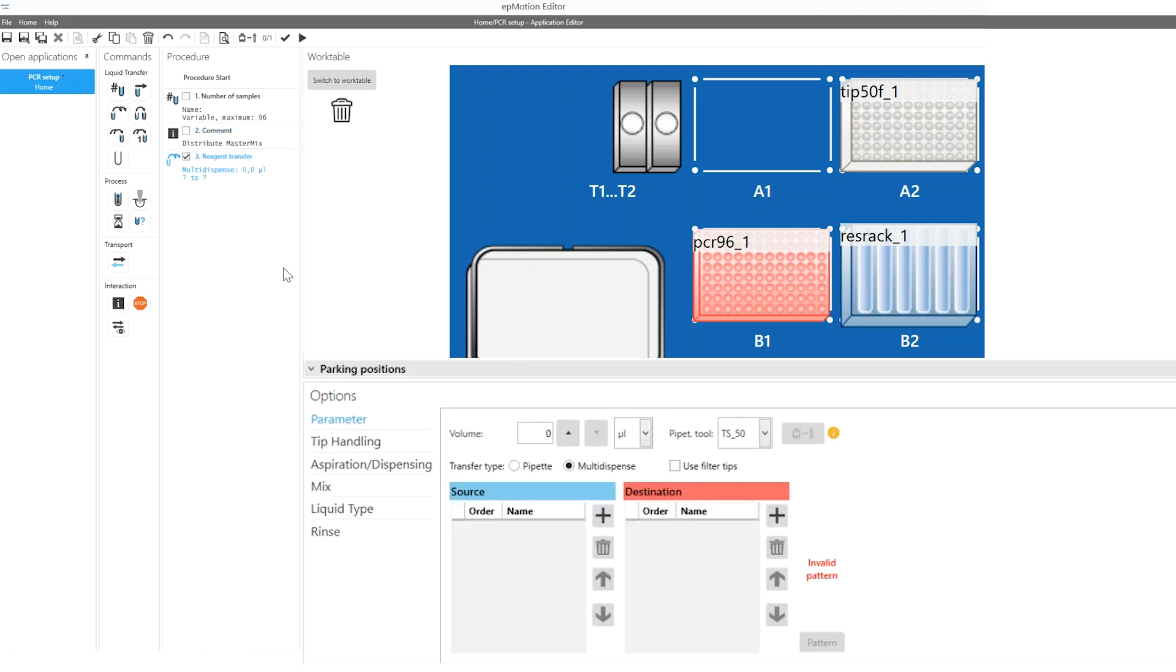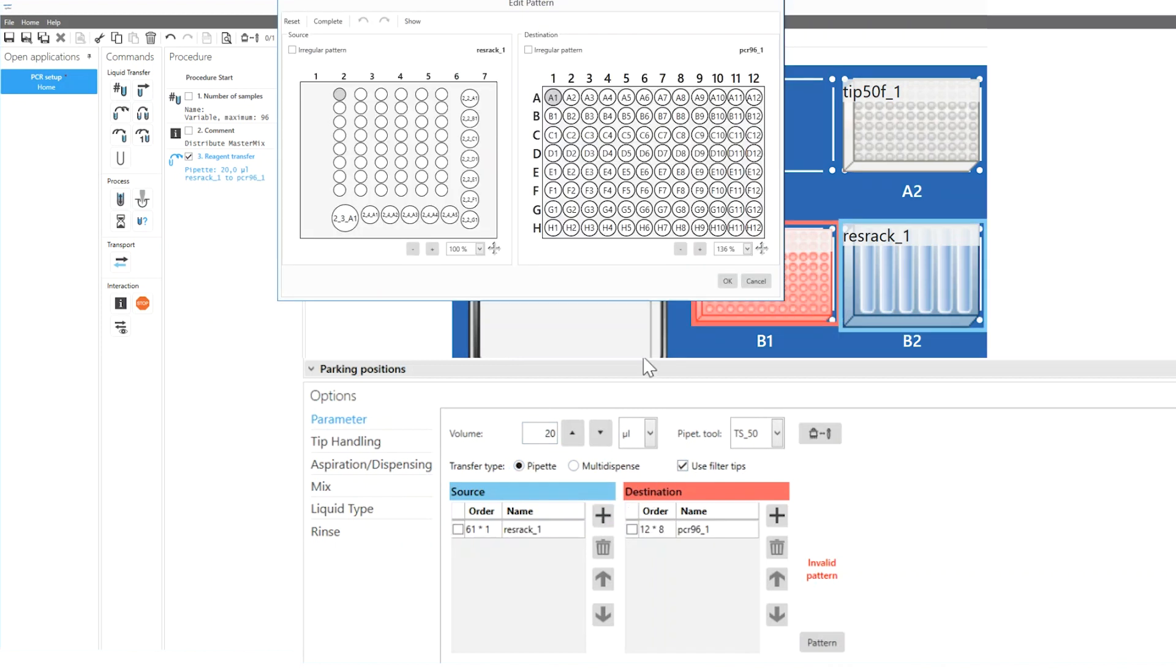A reagent transfer command is used to transfer PCR reagents from the source to several destination vessels. You define the volume, transfer type, tip type as well as source and destination labware.